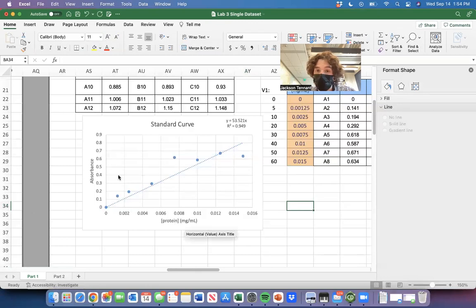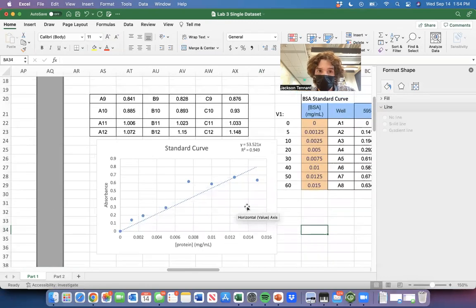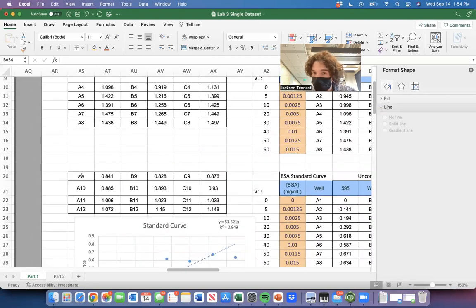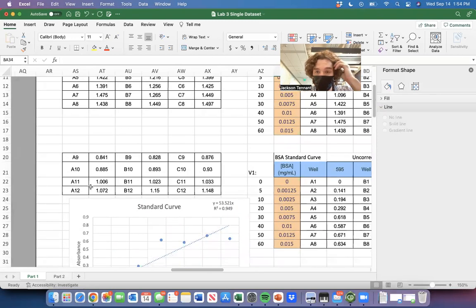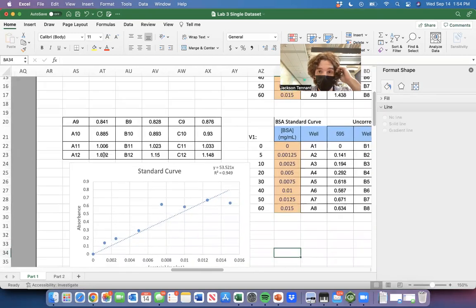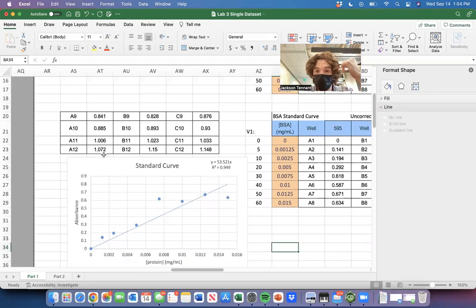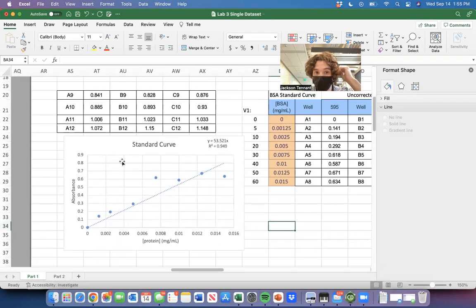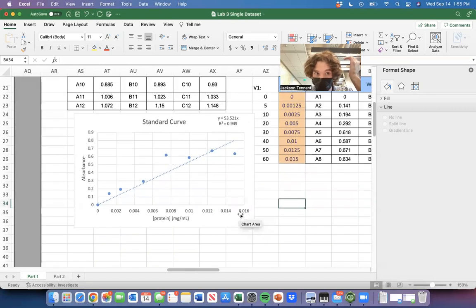And the absorbance. So the second part of this, in columns 9 through 12, is asking for you to now take this absorbance value and tell me what was the concentration of the stock we started from. And so you're going to need to figure out how to do that. I don't want to show you absolutely everything, but I'm going to work one example for you.